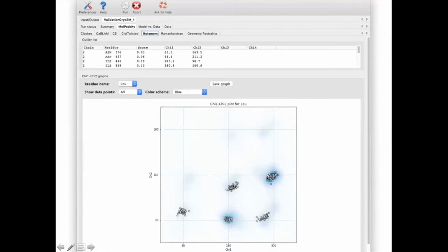I mean, here, for instance, it's very much inside this commonest rotamer. There are two rotamers, the MT and the TP, that take up about, I don't remember, 95% of the leucine rotamers. And in the data, they're much broader distributions where they're not restrained.